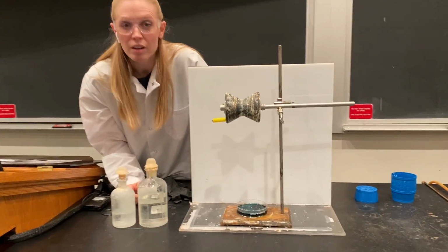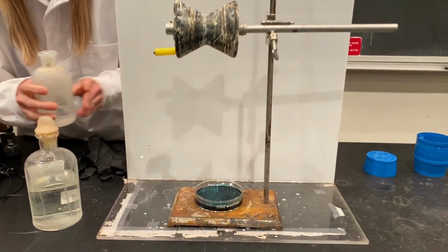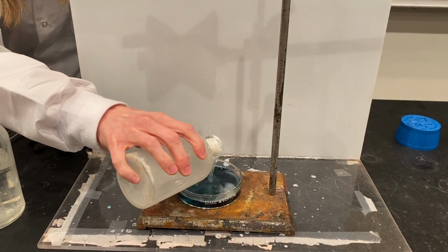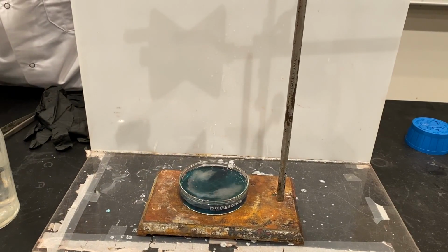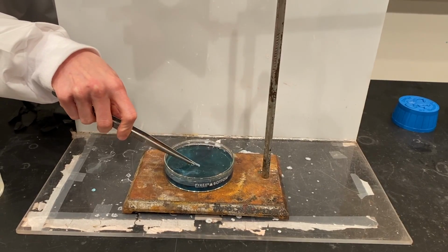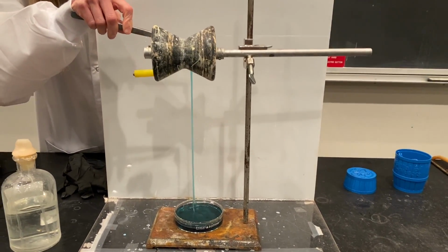Nylon is a polymer, and here I have a solution that we've colored blue, and when I pour this top solution over it, there's going to be a chemical reaction at the barrier between those two solutions. And if I pull on it, the molecules start sticking together and linking up into that big, long polymer chain.